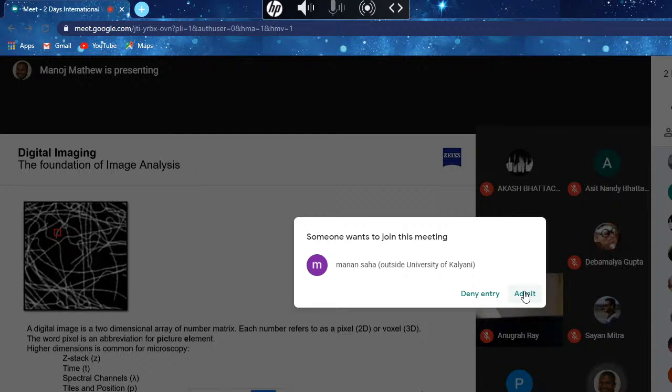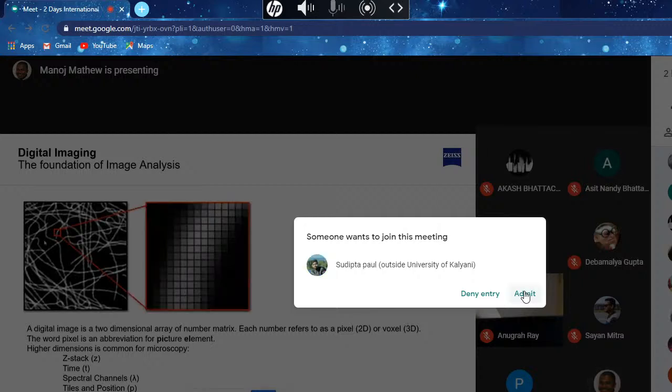Now, if intensity is a function of space in an image, the best way to represent that is as an array of elements. And these elements, some of you may already know, are called picture elements, or what we generally call a pixel. So I have an image here, and if I zoom into this little region, you can start seeing the individual elements. These elements are called pixels, and a pixel has a fixed intensity value. That's how you would represent a pixel.